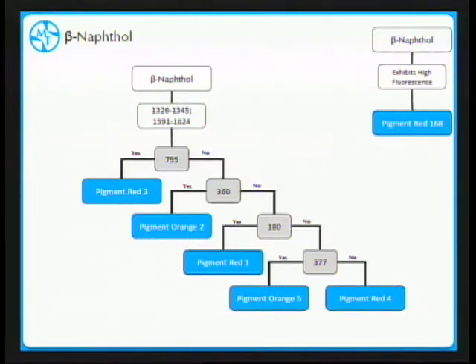That was one of the limitations when we were doing this work earlier on. We didn't know, if pigment yellow 74 pops up on our spectral hit match, are there other pigments that have a similar or indistinguishable Raman spectrum? This scheme should help to do that. And then we have some beta-naphthol pigments, or a pigment that fluoresces. As a result, it's listed here so you know that it's there, but it doesn't give a Raman spectrum.